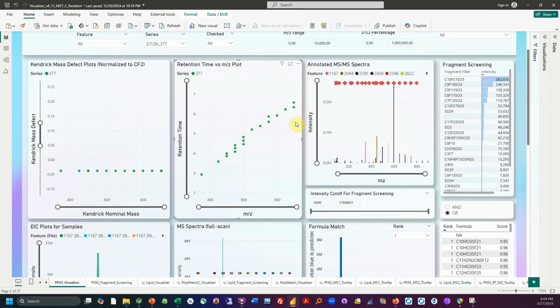And I can then confirm all these species, and we'll show you in that separate video tutorial how to do that. Now, the other thing that we can look at is the MSMS spectra. In this case, we have confirmed species with an A, so it's maybe not necessary to look at the MSMS, but I would never trust software right off the bat. You want to use your mass spectrometry expertise to make sure that everything makes sense.